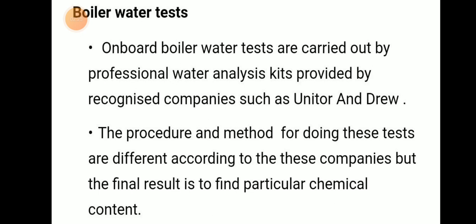Boiler water test. On-board boiler water tests are carried out by professional water analysis kits provided by recognized companies such as Unitor and Drew. On my ship we have used Unitor. The procedure and method for doing these tests are different according to these companies, but the final result, to find the particular chemical content, is the same.